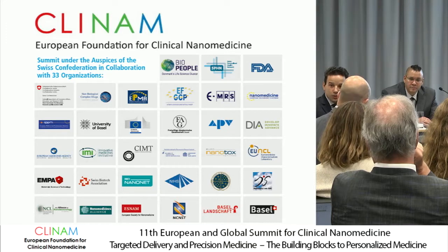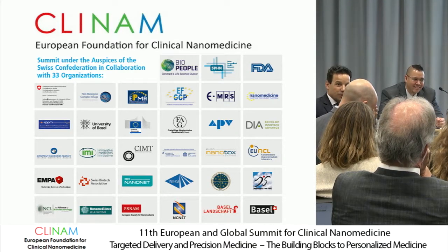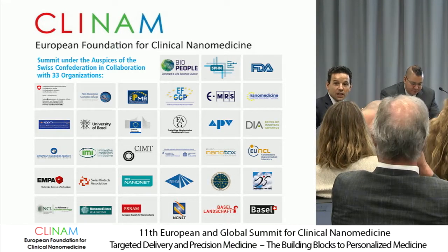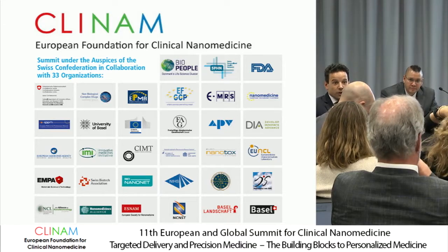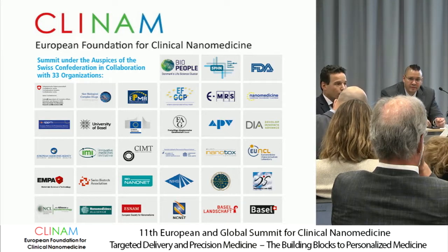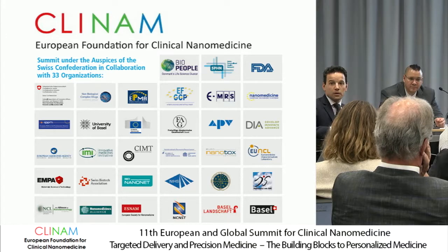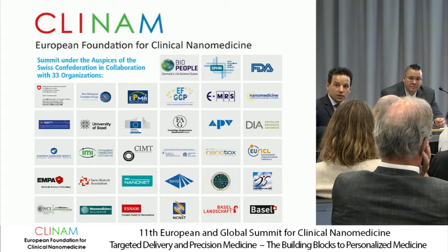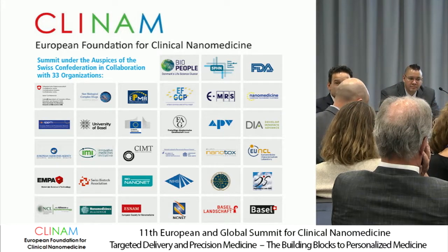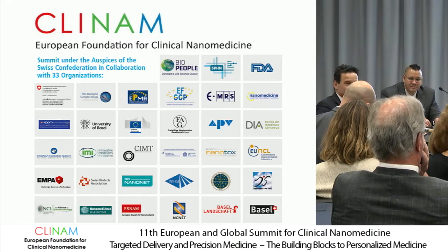Let's not go into nanobiomaterials for the different applications, whether a medicinal product versus a medical device, because even in that case you have different definitions and you comply with different standards for assessment. So it's open, and this is where we want to hear more from everybody in terms of methodologies, characterization, what the critical important steps are, what we did wrong as well, or what we are not doing that we should do.